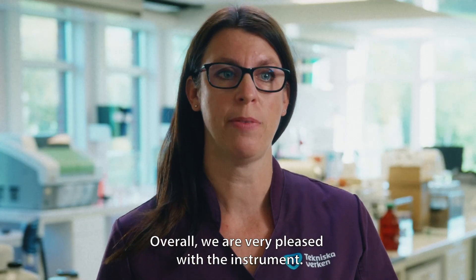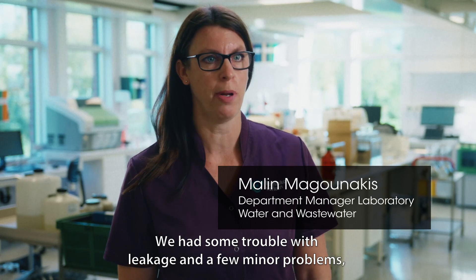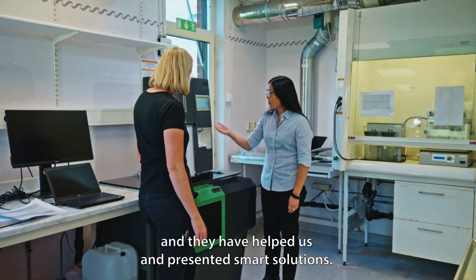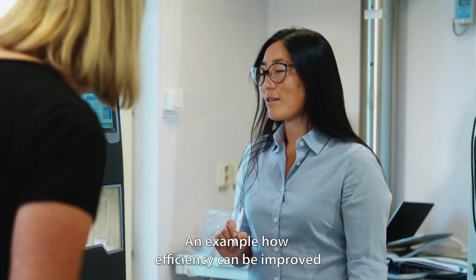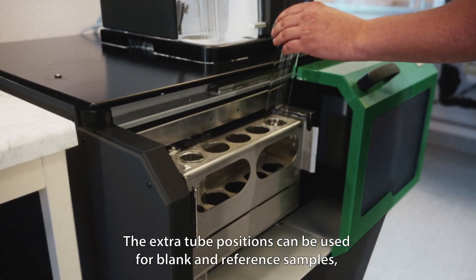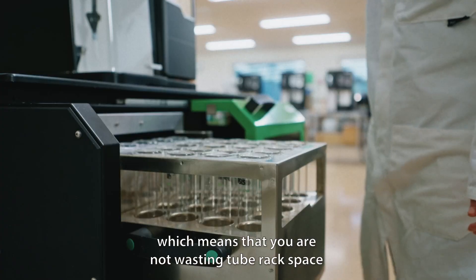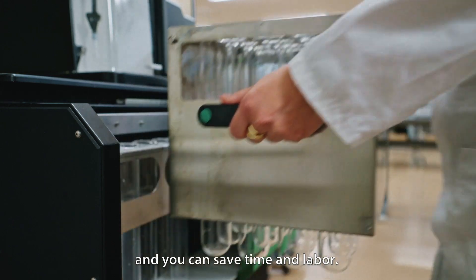Overall, we are very pleased with the instrument. We had some trouble with leakage and a few minor problems, but the collaboration and dialogue with Opsys is very good and they have helped us and presented smart solutions. An example of how efficiency can be improved is the extra five positions we implemented into the Auto Sampler. The extra tube positions can be used for blank and reference samples, which means that you are not wasting tube rack space and you can save time and labour.